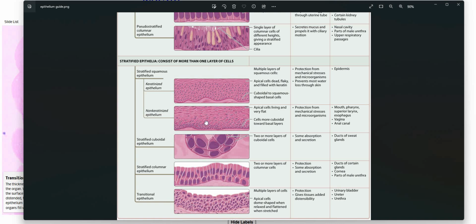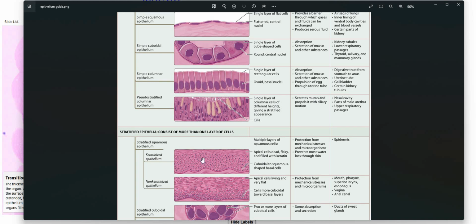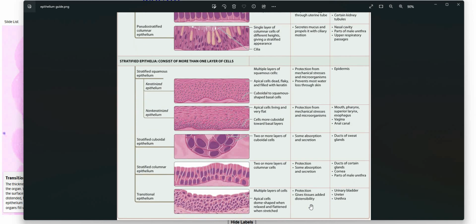If I were to ask you this, I know that it can easily be confused for these other types of tissue, so I might clue you in by saying, identify this type of tissue that is commonly found in the ureters. Well, if you know the location of transitional epithelium, then that definitely narrows down your choices as well. So that's part of the reason we're filling out the table in this worksheet, to help give you some context for these types of tissue.